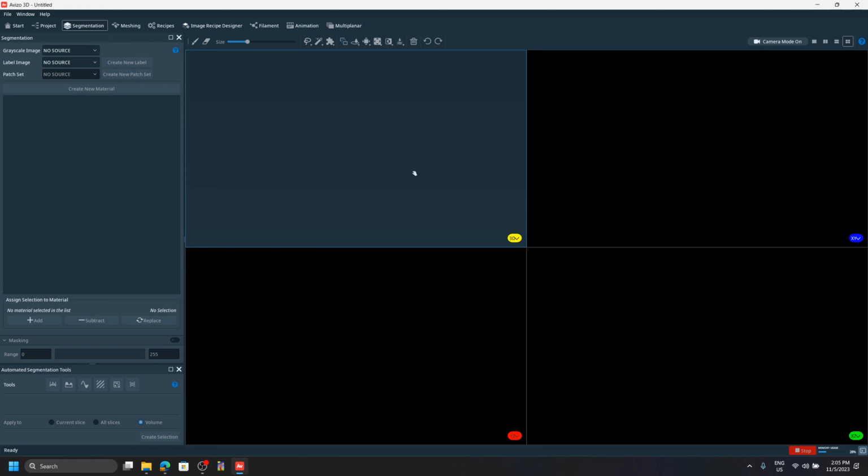And this is how it looks, right? It looks a bit confusing in the beginning, but it's actually simpler than the classic workroom, okay? So anyway, let me go through the parts. So on the upper left here, we can specify the image that we want to segment.